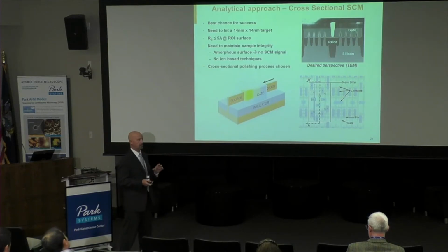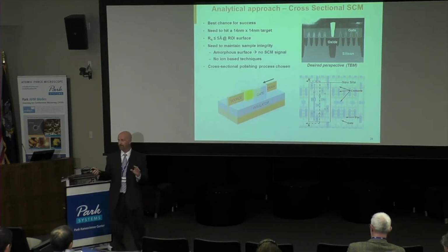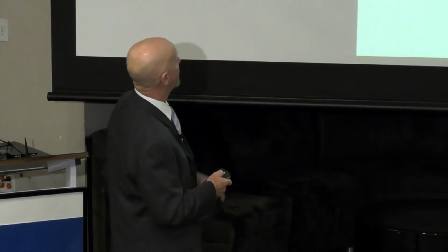So we had to resort to our traditional brute force method of grinding away silicon and then slowing down the polish as we approach the device. And this is a testimonial to my colleagues who actually prepped this sample, to their skill and patience in doing this. And I'll show you why in a second.